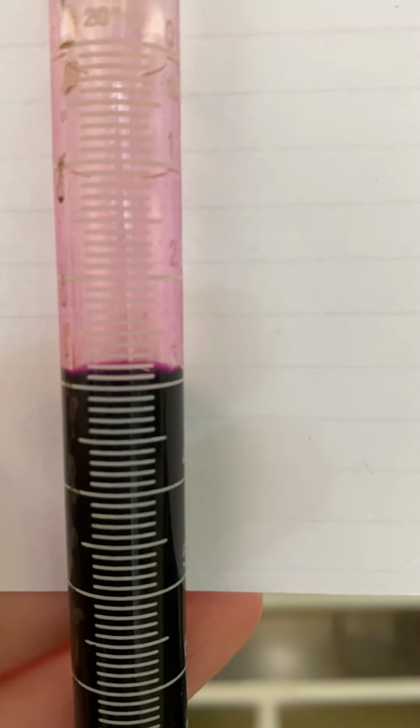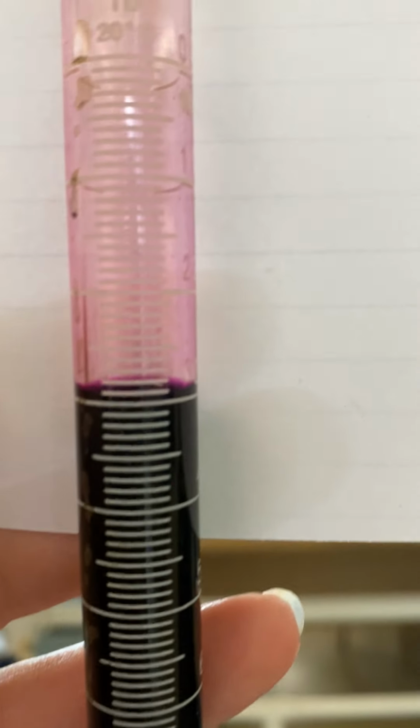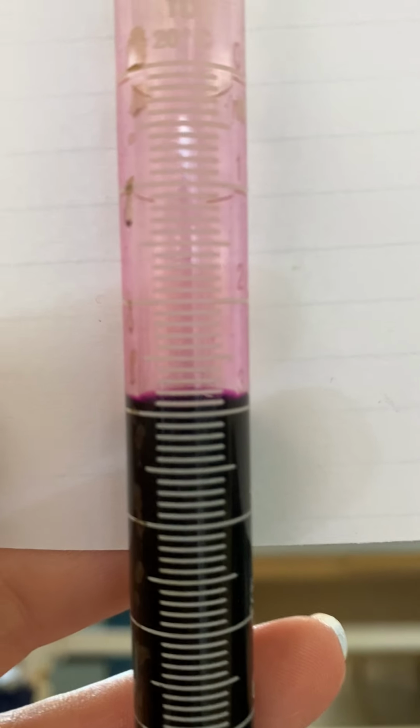I grabbed a stool and I'm trying to get us up to eye level. Okay. I'm trying to get this so that you guys can see, but it's just going to be very hard for us with the camera to see that dark meniscus.